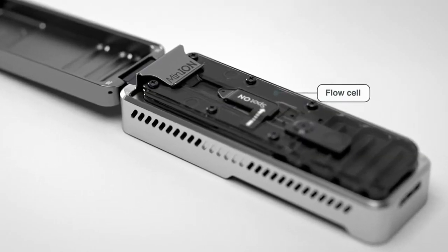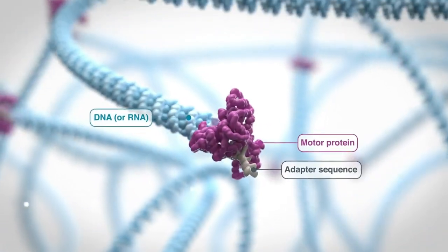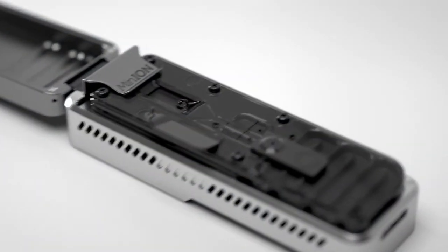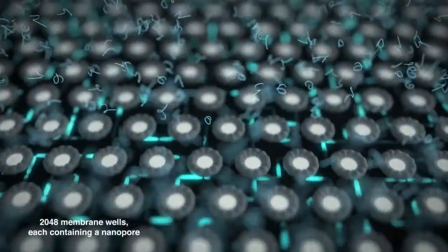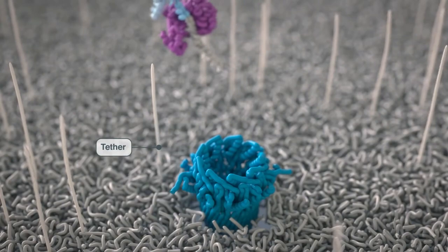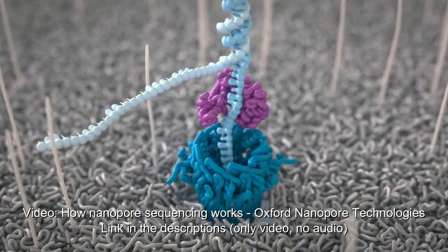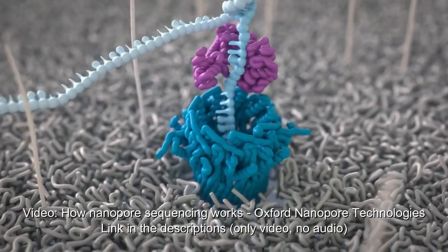In this technology, protein nanopores are embedded into a synthetic membrane bathed in an electrophysiological solution, and an ionic current is passed through the nanopores. As molecules such as DNA or RNA move through the nanopores, they cause disruption in the current. This signal can be analyzed in real time to determine the sequence of bases in the strands of DNA or RNA passing through the pore.